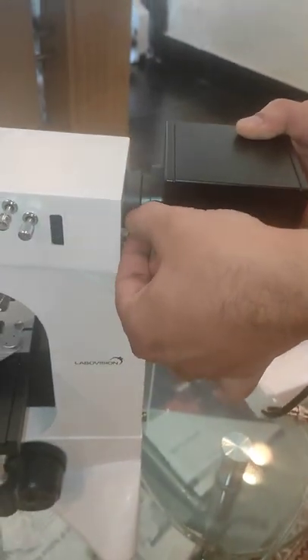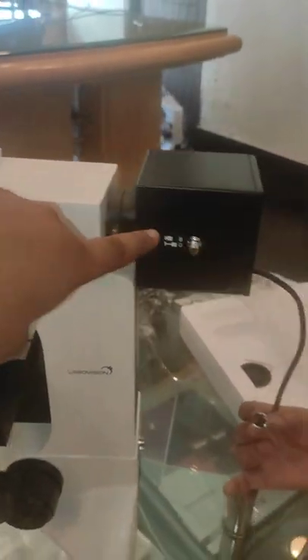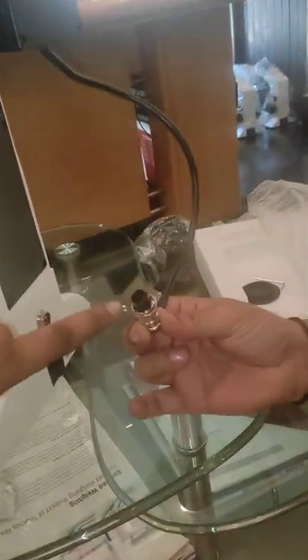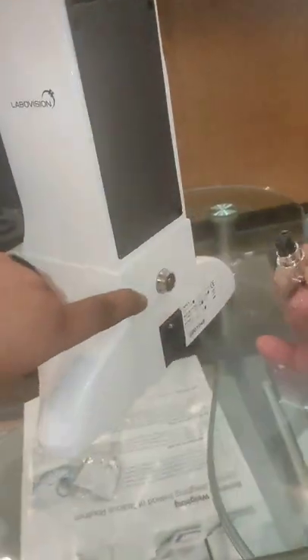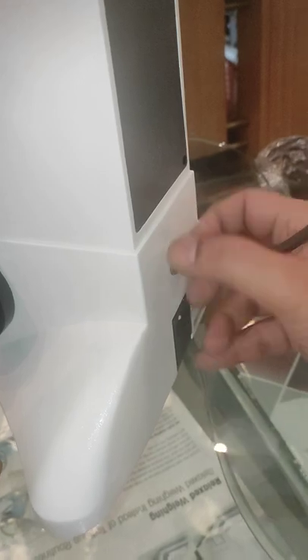So this attachment is the light source, as we have placed in the fluorescence attachment. This is the light source which gets connected to the socket given at the back of the microscope — the two pin sockets, you can see.